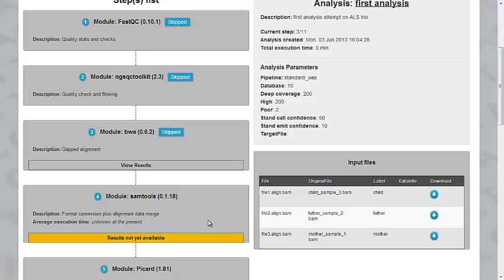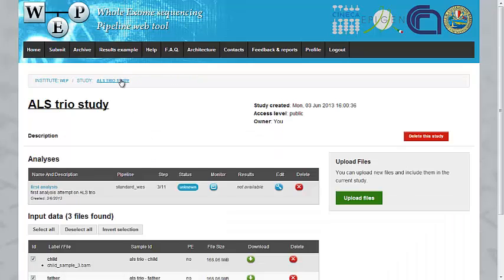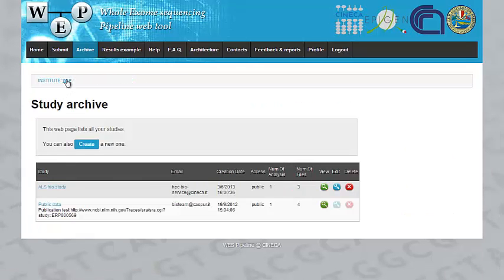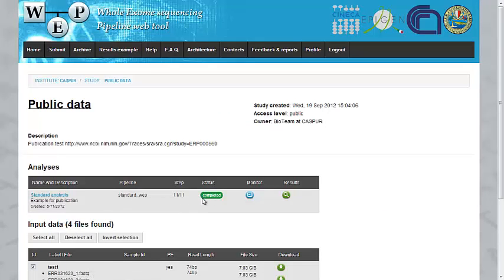Now I'm going to show you a completed analysis and how it looks like. We return to our Institute page. In this case, we have some public data we analyzed. This analysis is completed.